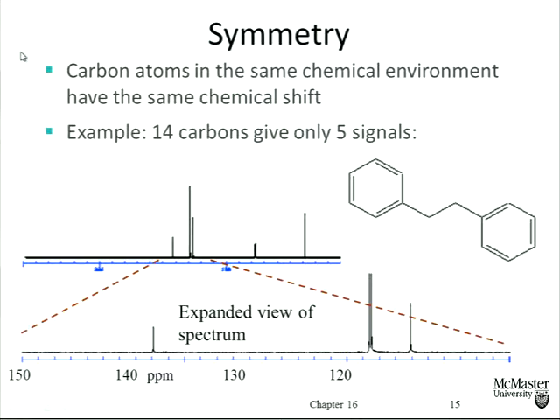Okay, let's do the next carbon over, the so-called ortho position for those of you who've studied disubstituted benzenes, which is a delight that's coming your way, right? Okay, how about the carbon at the bottom of the left-hand ring? Any other carbons in that ring that are in the same environment? Northeast, right? Yeah? Does it look the same? It doesn't look quite the same.